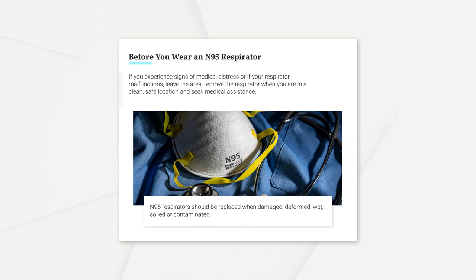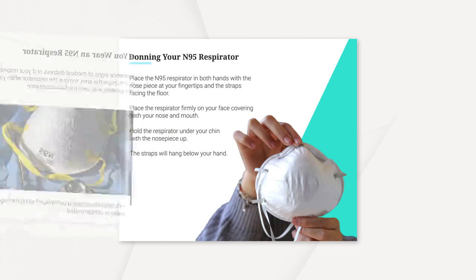If you experience signs of medical distress or if your respirator malfunctions, leave the area, remove the respirator when you are in a clean, safe location, and seek medical assistance. N95 respirators should be replaced when damaged, deformed, wet, soiled, or contaminated.